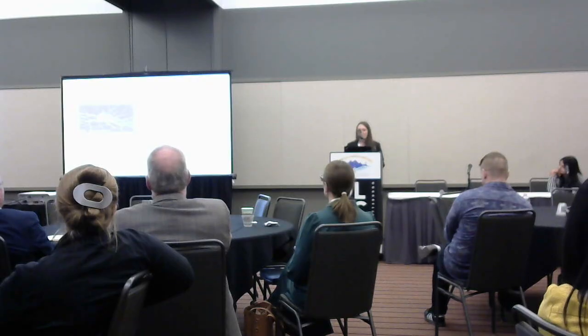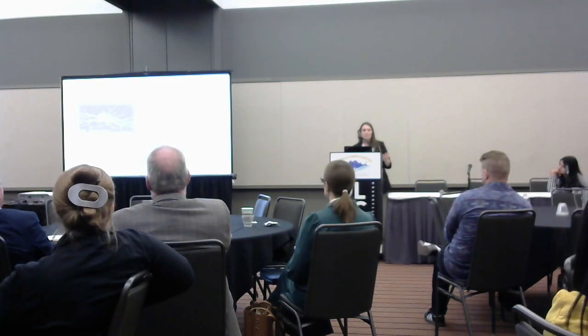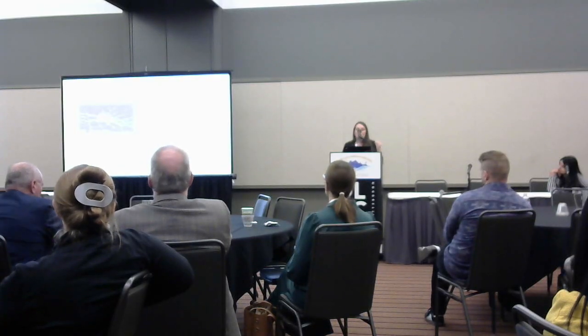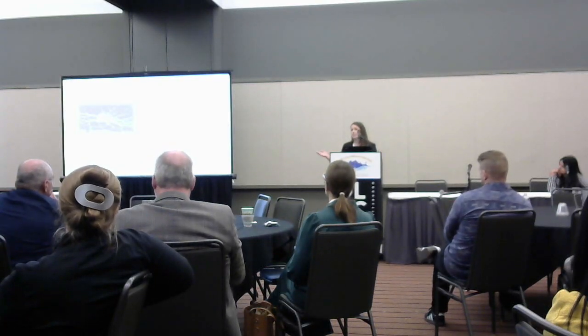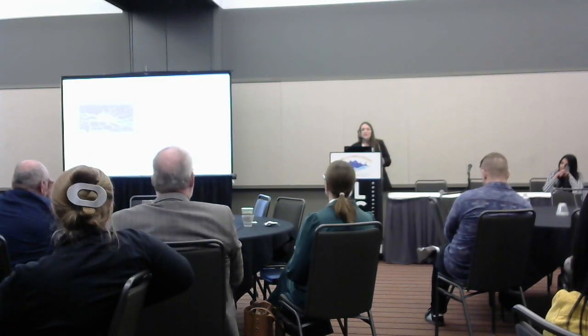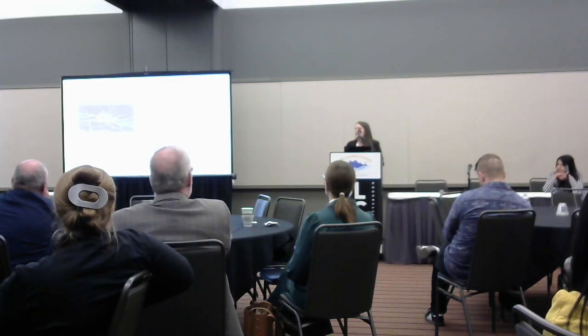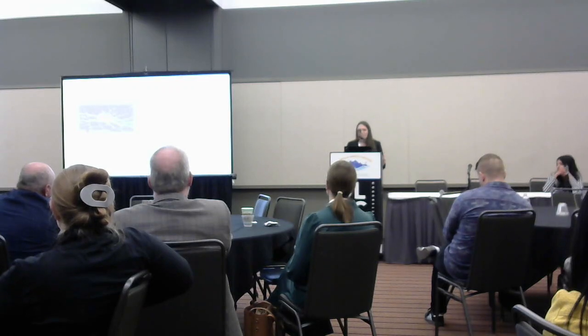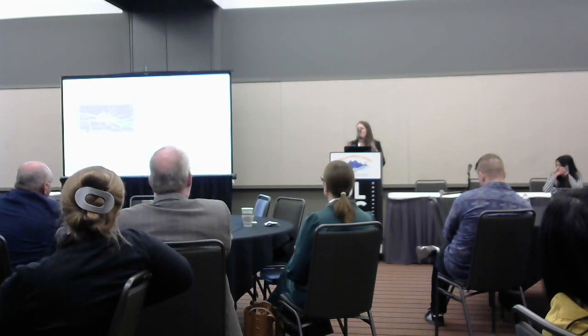But when you're working with somebody else, the skill level of the researcher and the researcher's goals is something that you have to keep in mind. So if they code in Python every day, that's an easy, okay, great, we'll keep it in the mix and allow the researcher maybe to choose. If the researcher's goal is to learn Python, and they want to use this as the opportunity to do so, maybe that's the approach you take. Otherwise, maybe stick with ImageJ or Imaris. Okay, so that's just a quick snippet, just something to keep in mind. It's very important, guides lots of what you end up doing.